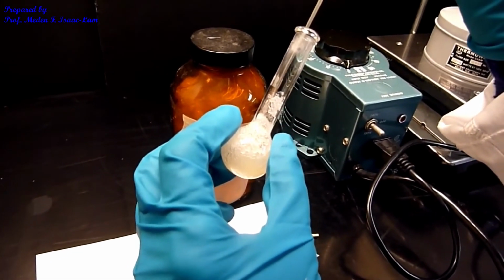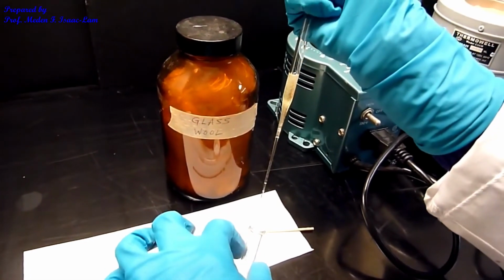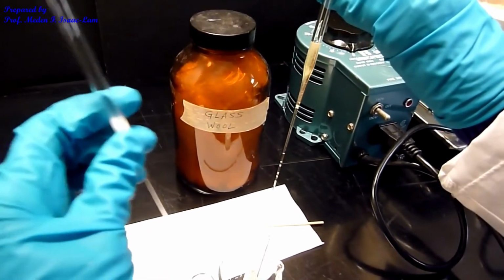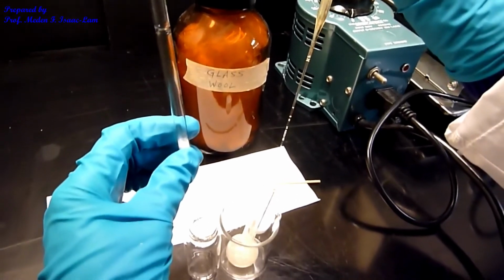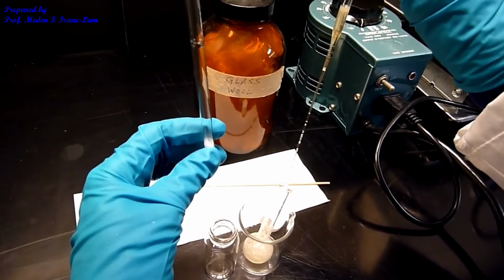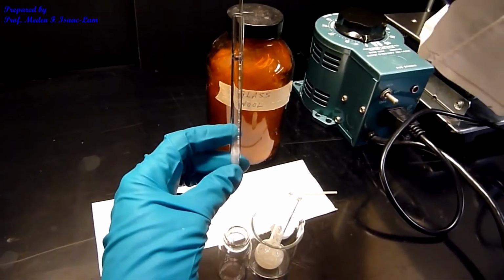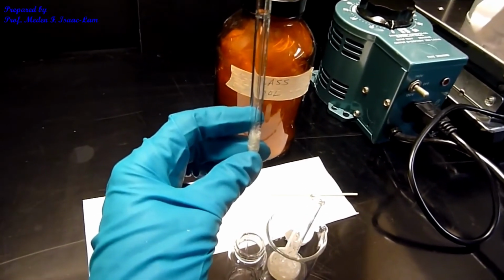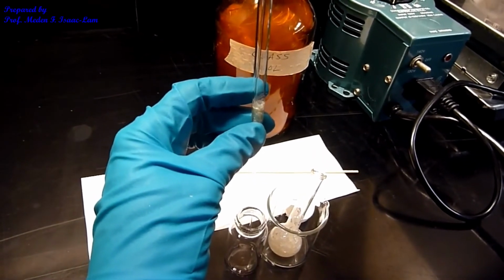So I don't want the solid, so I'm going to filter. So I have another pipette, and then into the vial. So you can see that I'm filtering the solid byproduct.